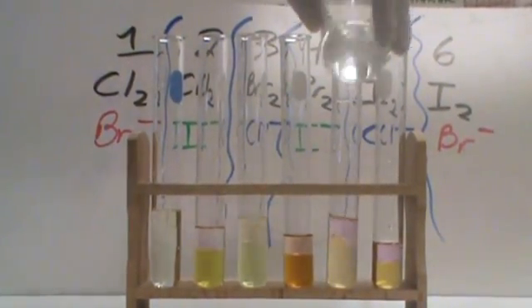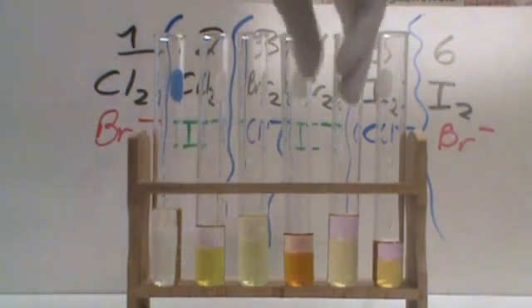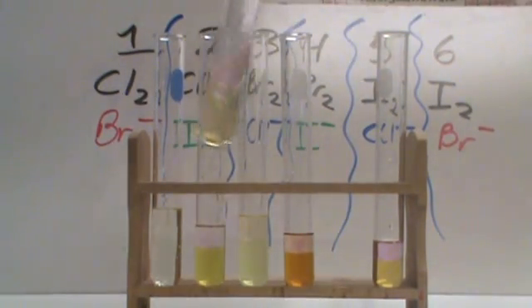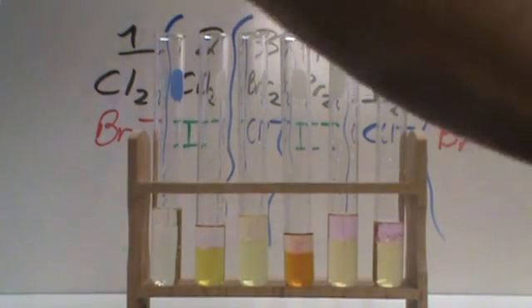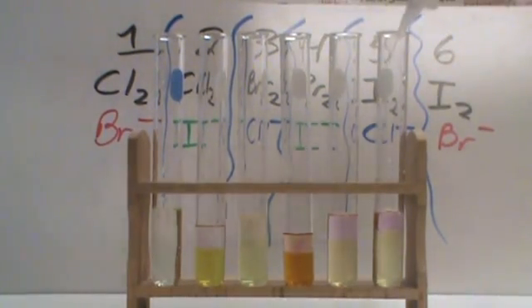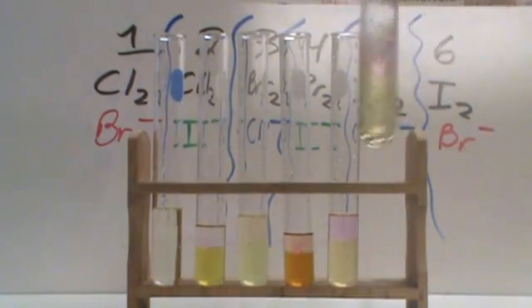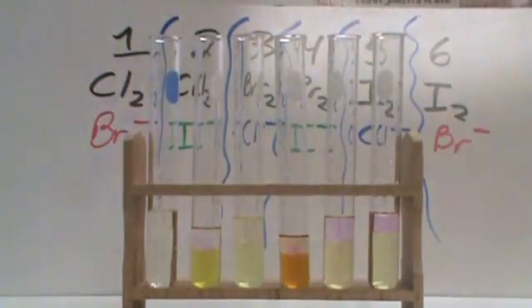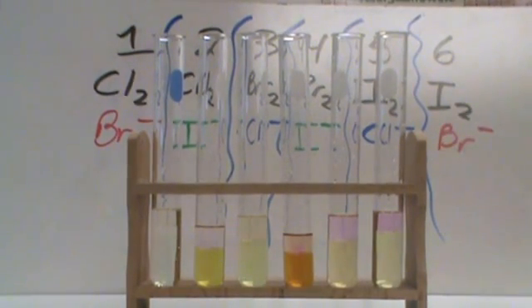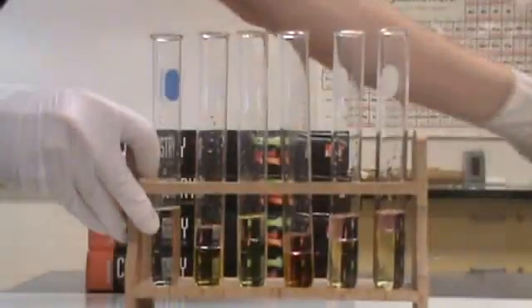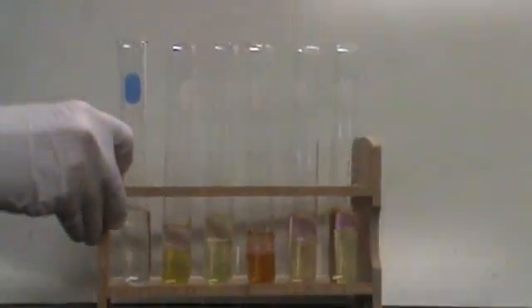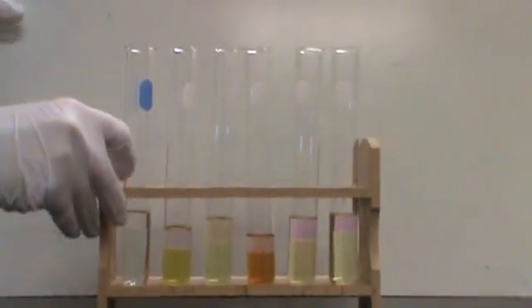Now in the last two, I'm going to put in some chloride into this one. Nothing's going to change. I'm going to be sticking with my iodine color. In the final one, I'm going to put some bromide. For consistency, I'm going to ramp that up with my slightly more concentrated bromide solution. Still, no change. I'm still left with the iodine as the principal feature. So what we can do is go through and analyze why this works the way that it does. Let's get a regular backdrop behind there so we can see those colors nicely.